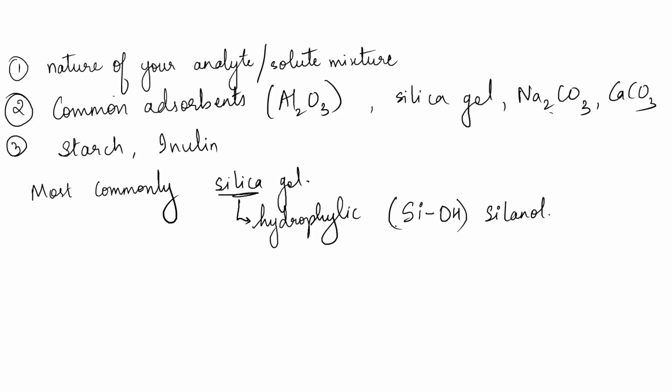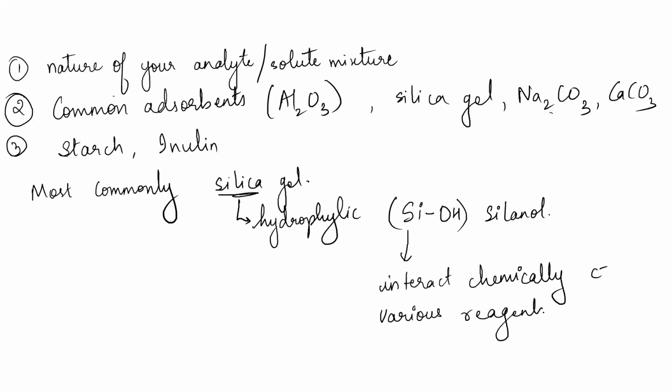Now this silanol group, this SiOH group, can interact chemically with various reagents. Have you heard about HPLC? High performance liquid chromatography. No?